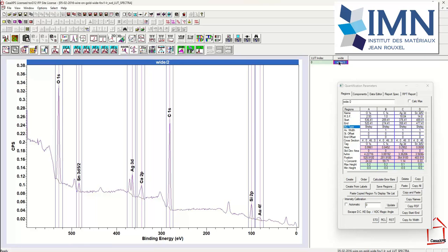So selecting the VAMAS block, that will be part of generating the report, but based on what we see in the active tile, all I have to do is press the calculate error bar, and what will happen is a Monte Carlo calculation will be performed that will estimate the range of possible values for these data given the amount of noise in the data.